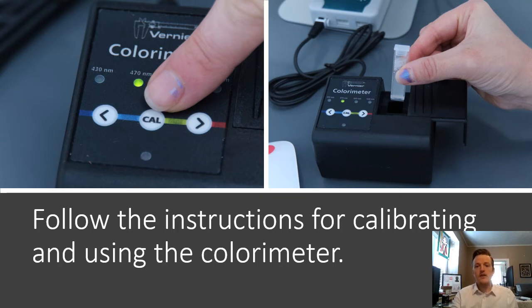Then, like most lab machines or whatever you're using to measure anything, you're going to have to calibrate the colorimeter, and typically this will be done with a negative control or a blank where it's just water. You'll read through how to calibrate it. When you do this in the future, you'll have to refresh your memory on how it works, but for this week's lab, just know that the colorimeter was calibrated ahead of time.